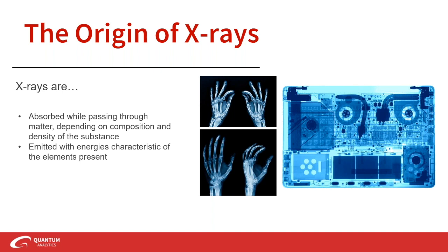Let's talk about the origins really of X-rays, right? So X-rays are super powerful. There's a lot of energy, so they can pass through things, which is key if you want to check out your bones inside your body from the outside of your body, right? Consider this: different atoms have different atomic weights. So a really high atomic weight, very dense atom is going to be able to absorb a lot of energy. Smaller atoms that maybe are looser and have lower atomic weight are going to get kicked around by any old photon that wants to come along.